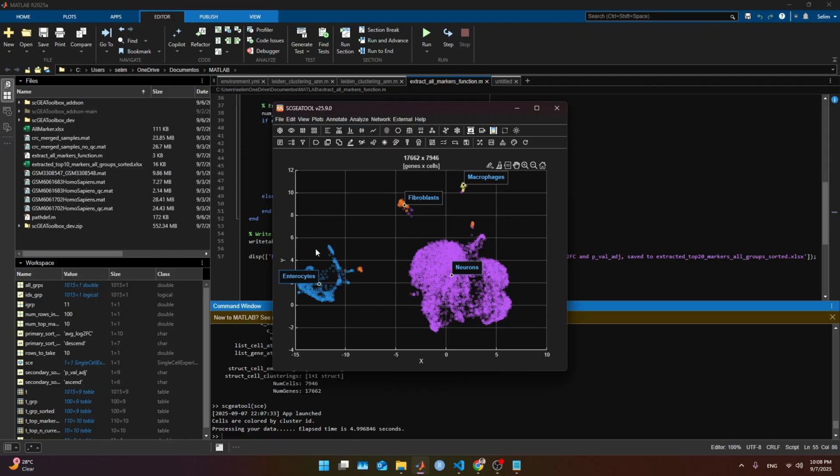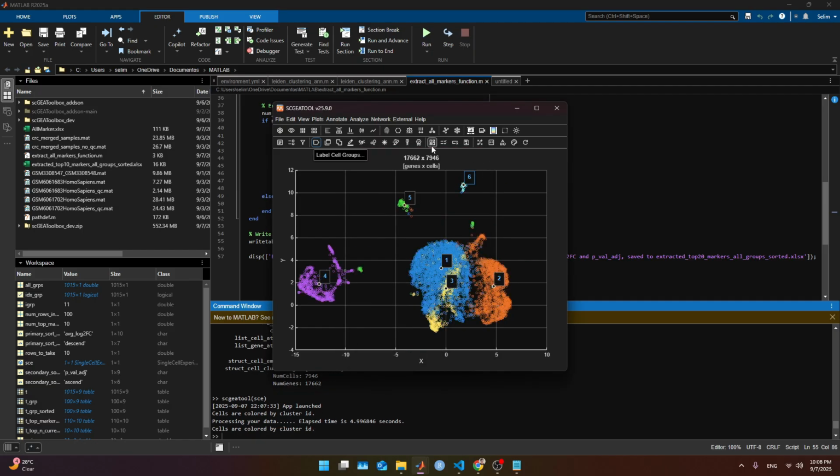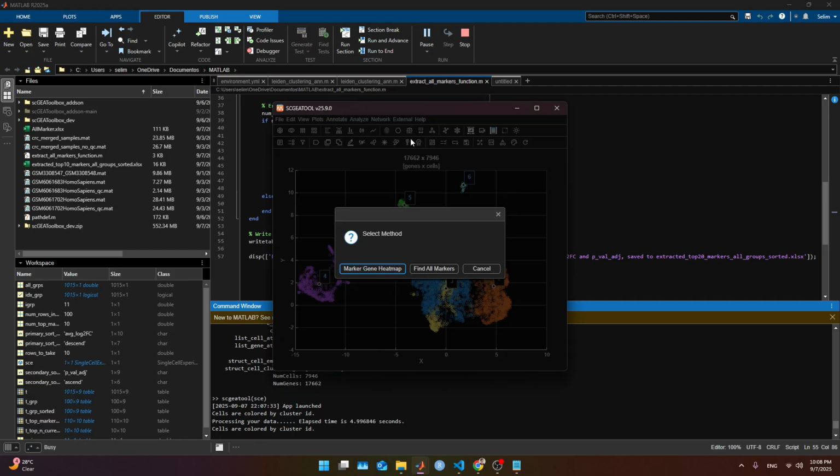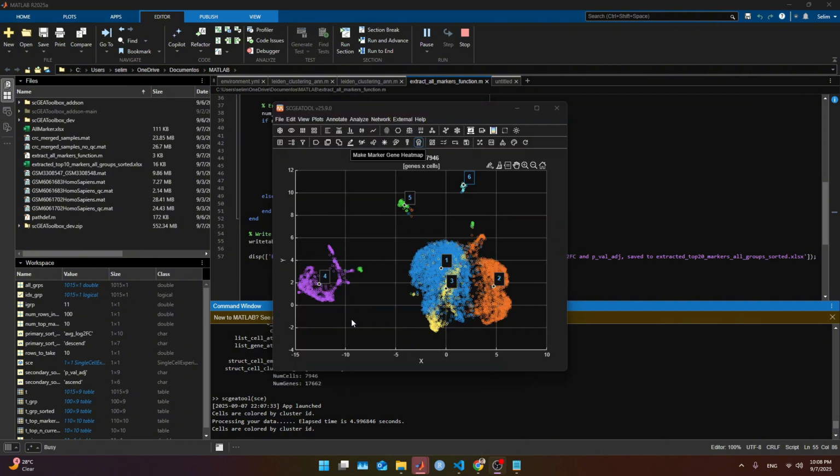Nice. We get enterocytes here, and I know these neurons are also enterocytes, but those are cancer-related cells, fibroblasts and macrophages. That's what we have. I'm a little bit happier with this, but still not super happy. So what we are gonna do to finalize here, we're gonna look at the clusters here and find all markers, cluster ID, and do the marker spreadsheet again.